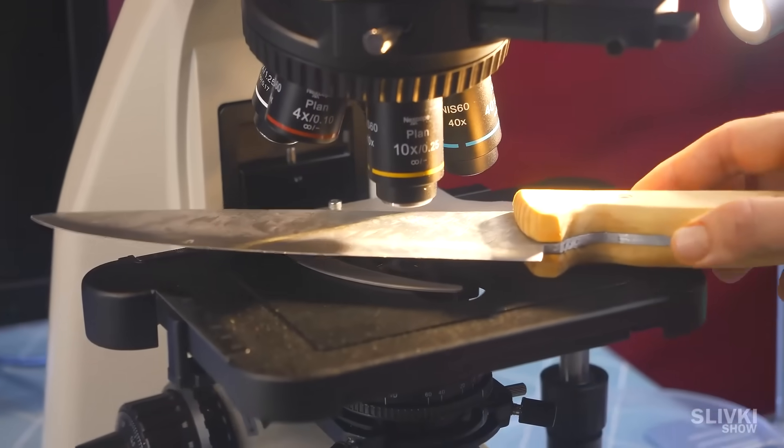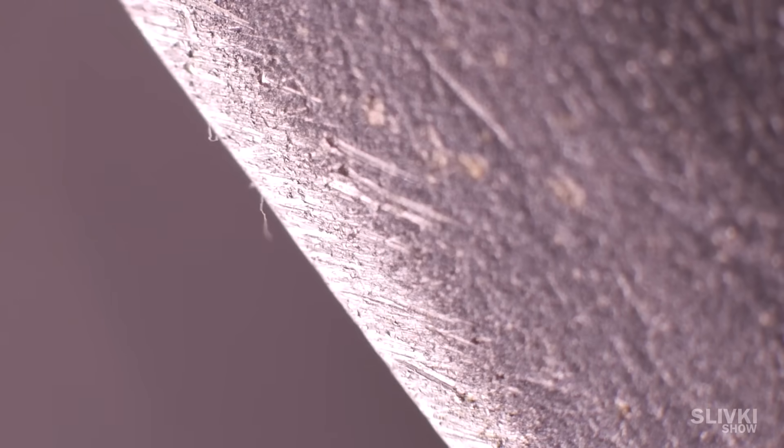Many people have asked us to show some metal. So here's our kitchen foil knife made from kitchen foil — this is aluminium. There are micro-scratches on it, even the sharp part is usually quite glossy.